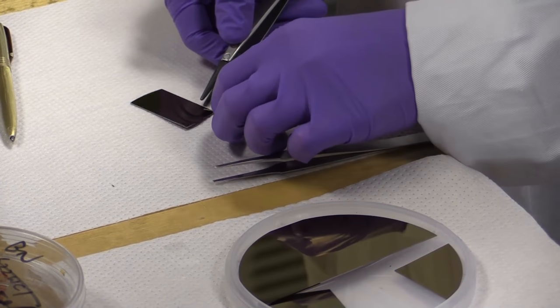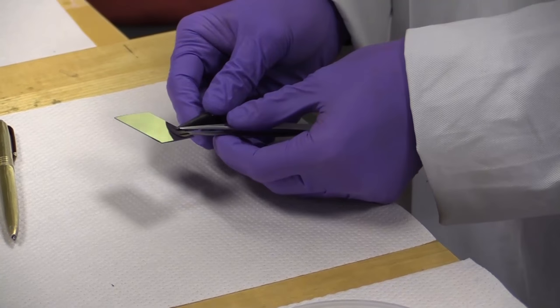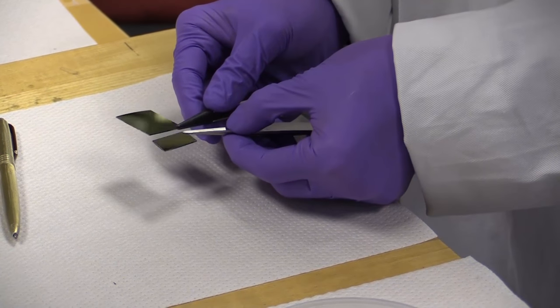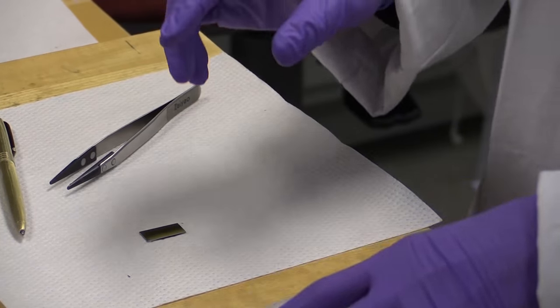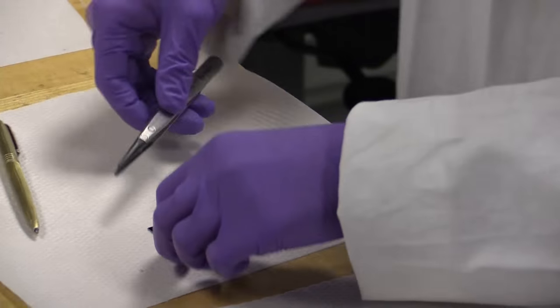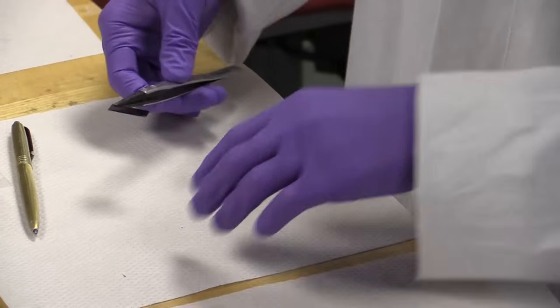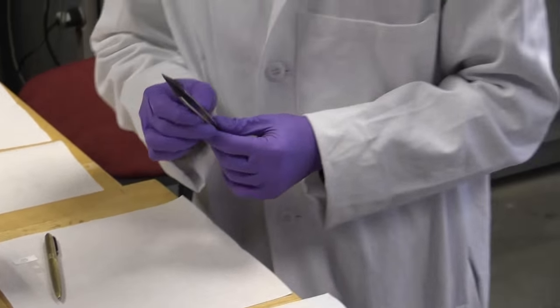There, I used a diamond scribe to just nick the side, and here, break it apart. Substrate cleanliness, we have found to be very important. So, we are just going to head over here and clean it with some IPA.